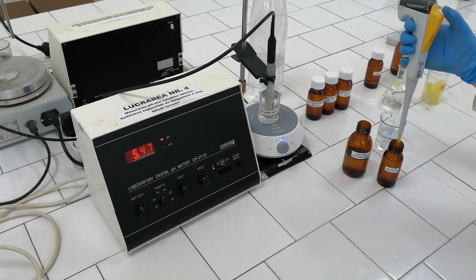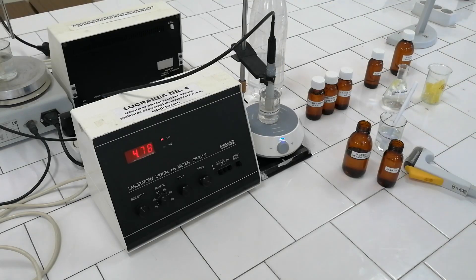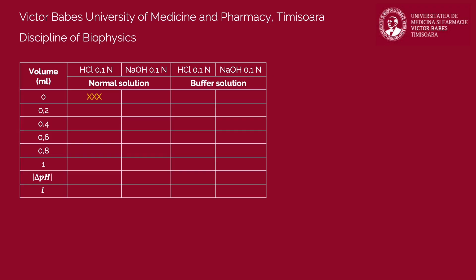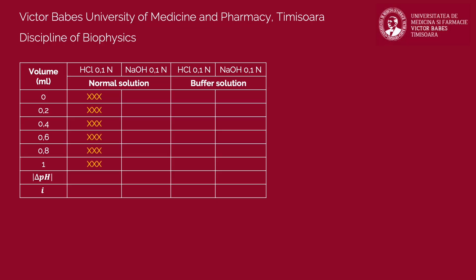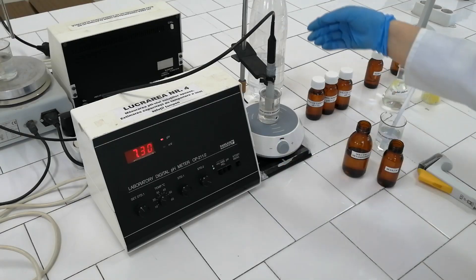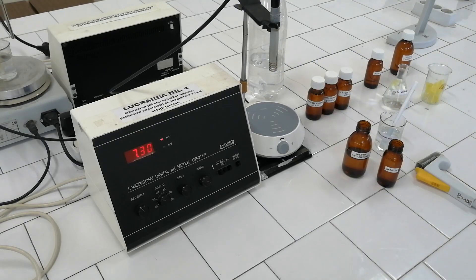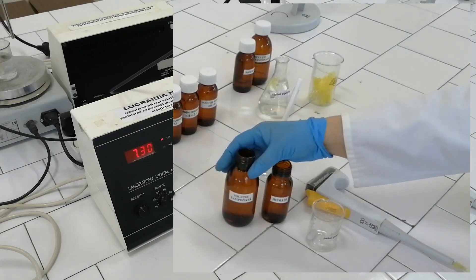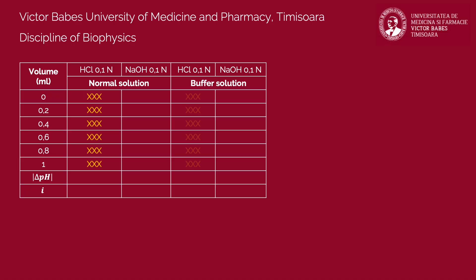Using a micropipette, add 0.2 ml of hydrochloric acid solution into the non-buffer solution. After waiting another minute, read the pH value and record it in the table. Repeat this operation four more times and write all the obtained values in the table. Set the pH meter in standby working mode, stop the magnetic stirrer, take out the measuring electrode, and discard the solution in the sink. Rinse all the instruments well with distilled water. Using the previous methodology, measure the pH of the buffer solution before and after adding small amounts of acid. Record all the obtained values in the table.